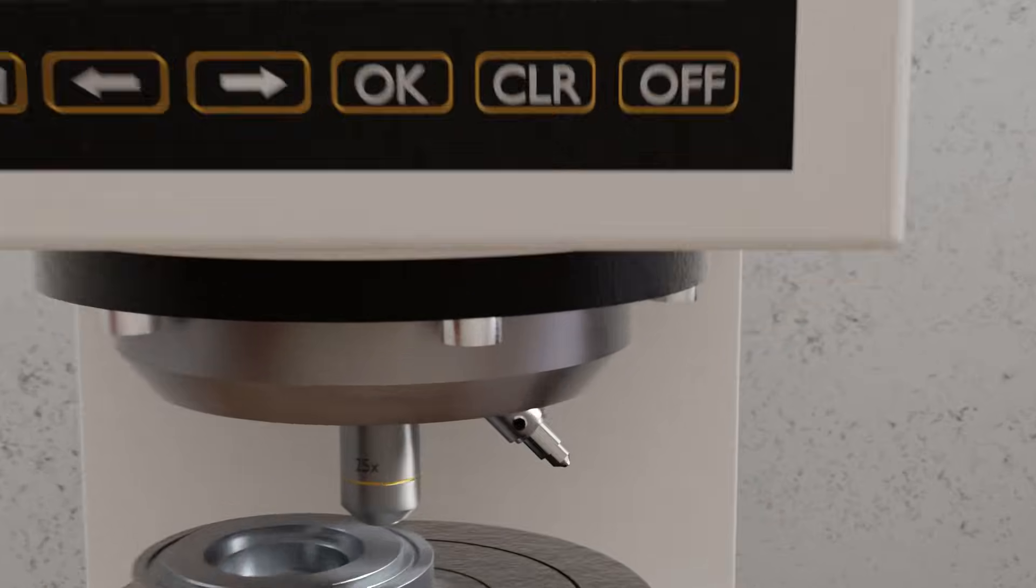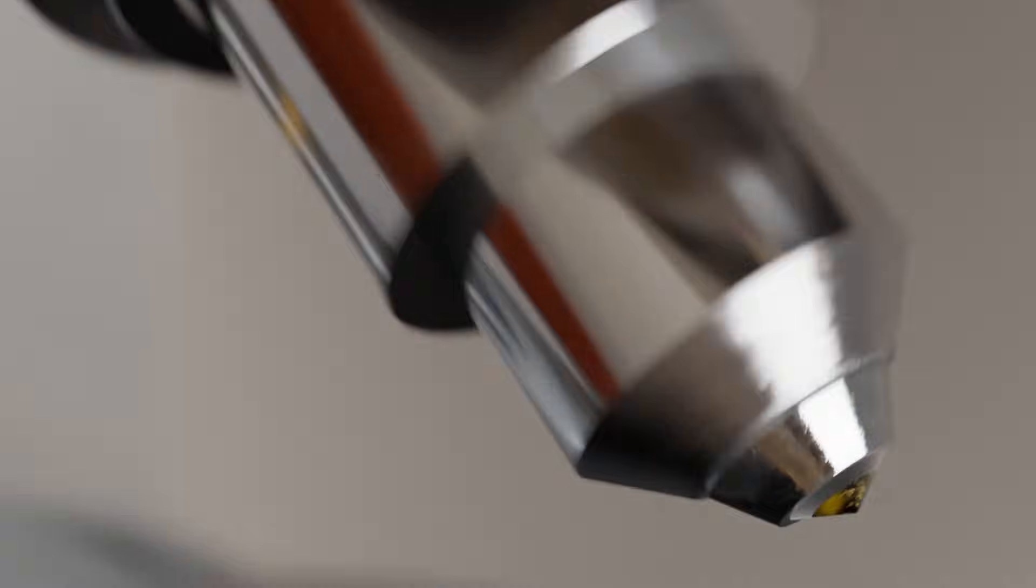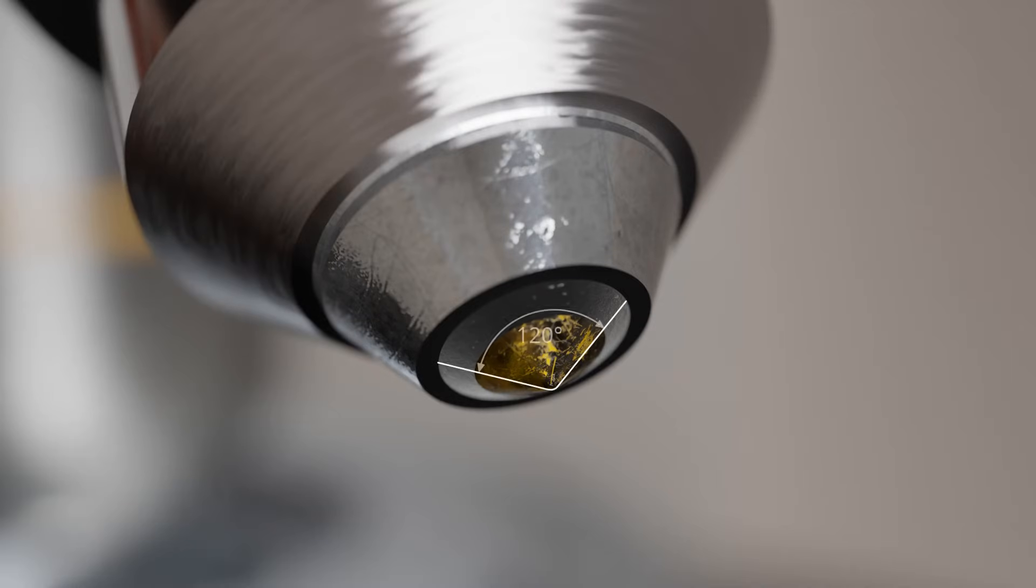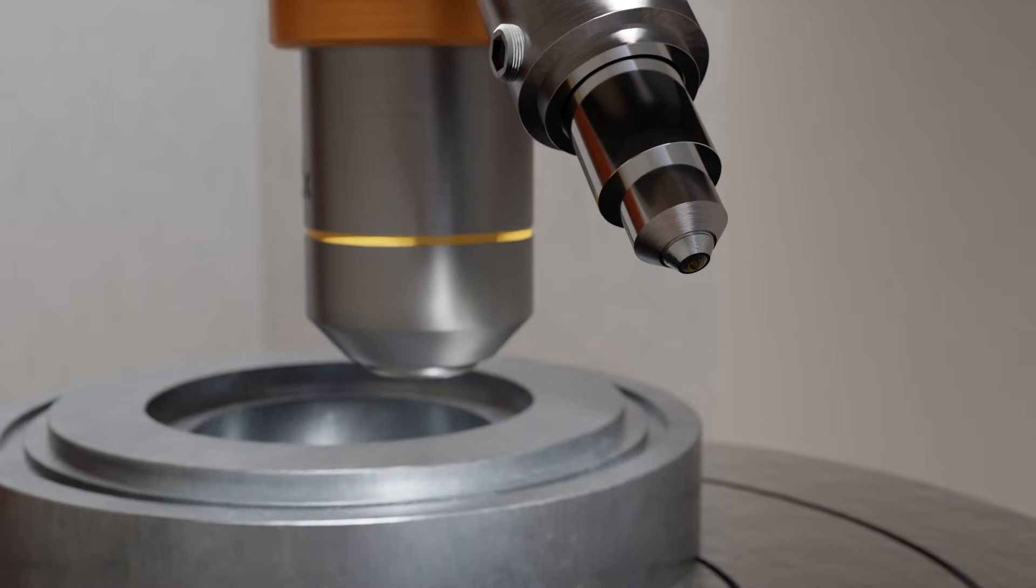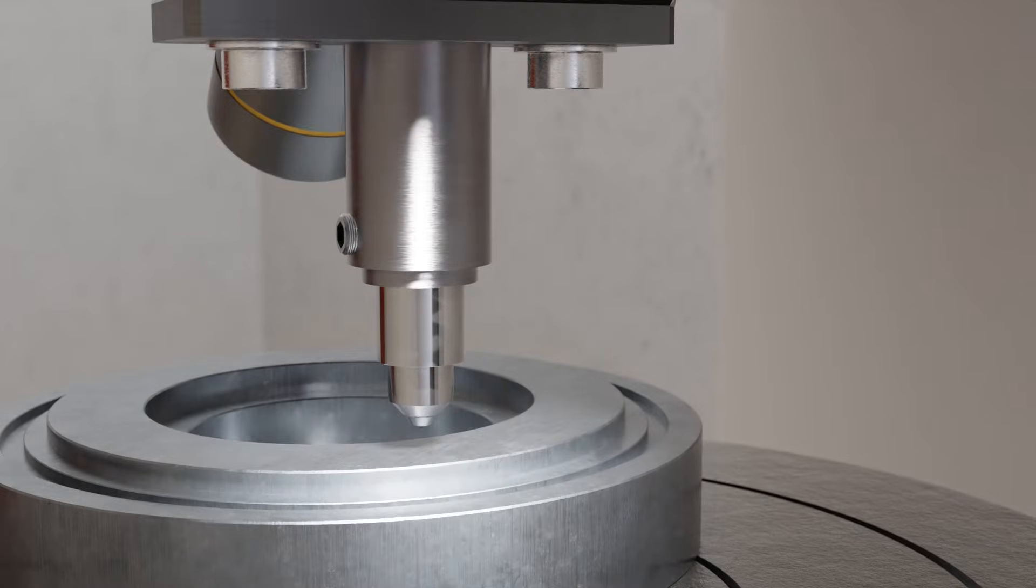The indenter used is either a cemented carbide ball or a rounded diamond cone with a tip angle of 120 degrees and a tip radius of 0.2 millimeters. The deeper the indenter penetrates the material under a given force, the softer the material. A key advantage of this method is that the indentation depth can be measured directly using the traverse path of the testing machine, eliminating the need for manual evaluation under a microscope. This makes the process highly suitable for automation in mass production.